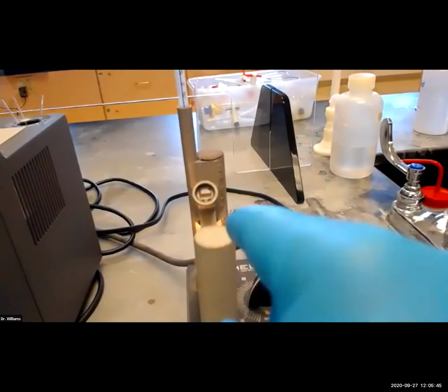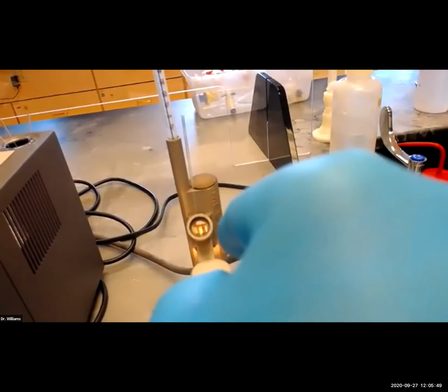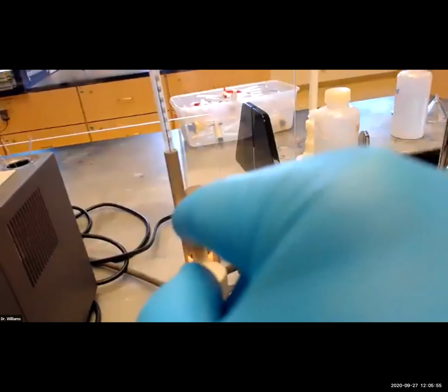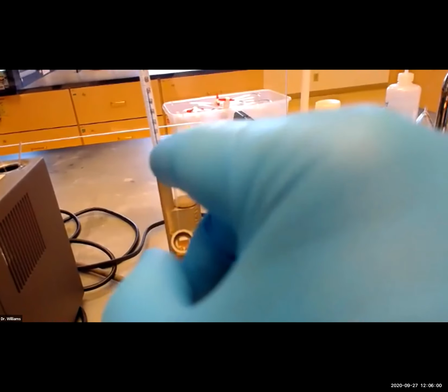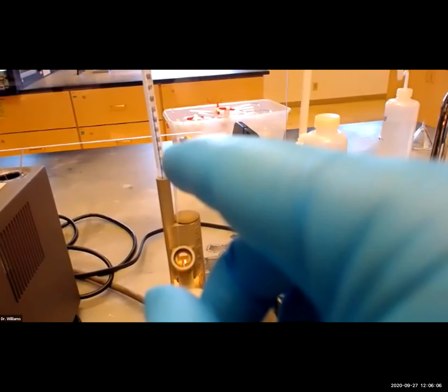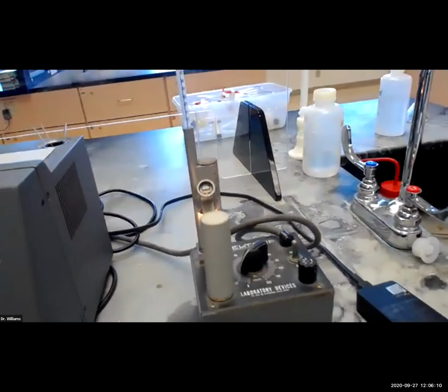You look through an observation port, and you can see there's a sample in there, whether you can see that white solid or not. And you observe where the sample melts as you direct heat to the sample. So the first drop of liquid which is formed, you write that down in your notebook, and then you continue to watch. And the last bit of solid that melts, you look up here, record that temperature, write that down in your laboratory notebook. So rather archaic in its design.